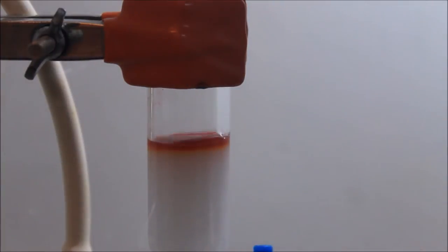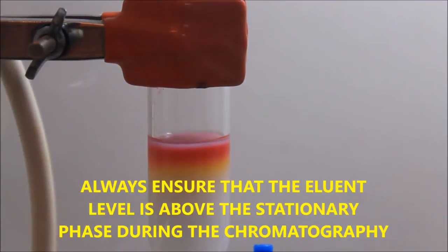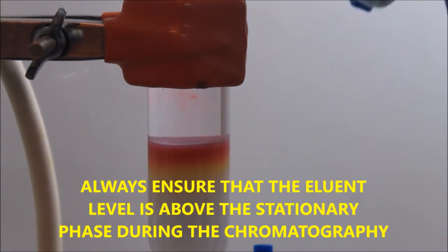Once the sample has entered the column, fresh solvent is added with care, trying not to disturb the surface of the silica gel. Alternatively, a layer of sand can be added to avoid this disturbance.